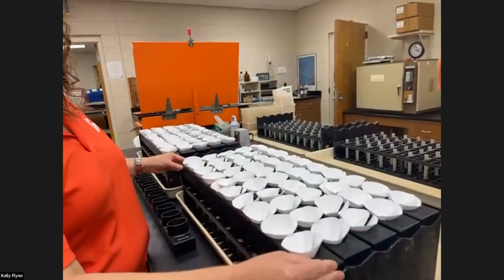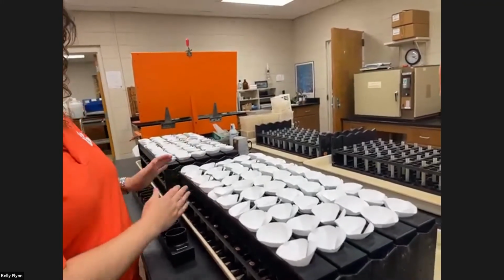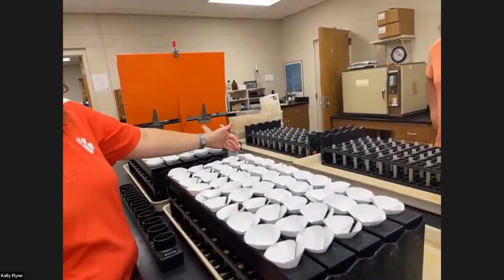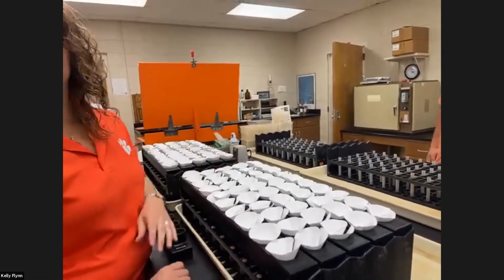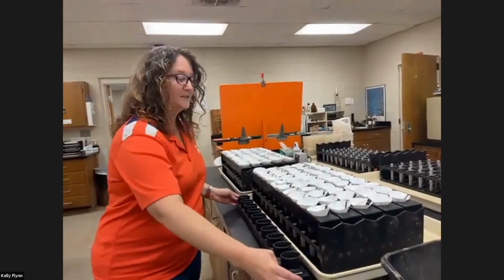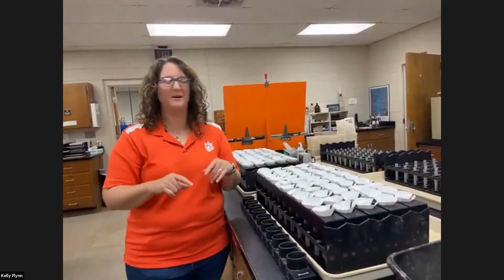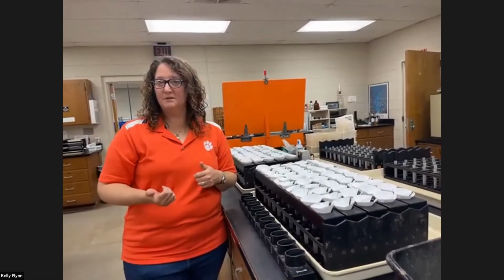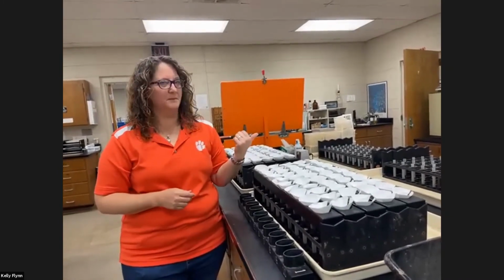So we analyze these 100 at a time, like Michael said, but we have to do about 10 at a time for this extraction process. And then these are grouped by 50 so that we can work through with some high throughput as we're analyzing the samples. All right, so once we get our test tubes, we're going to move on, but we're going to take a pause and talk about the other section of our soil analysis. So part 2 is a pH analysis, and that prep also happens in this room, and Michael's going to tell you a little bit about that.